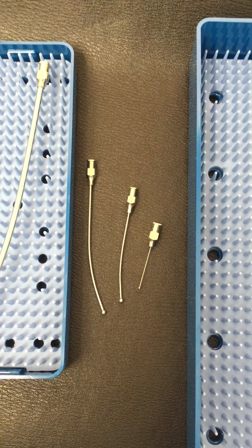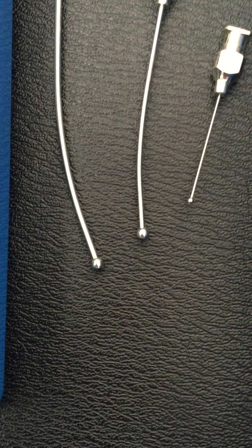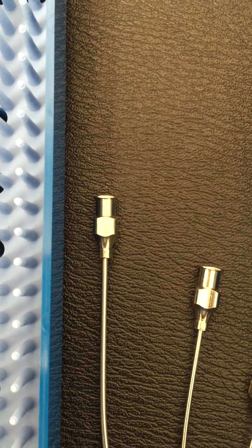They are made of stainless steel tubing. They have a smooth stainless steel ball tip, and they have a reusable metal hub that will fit on any syringe.